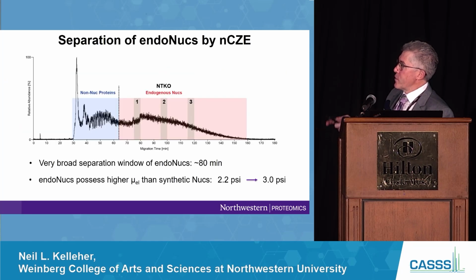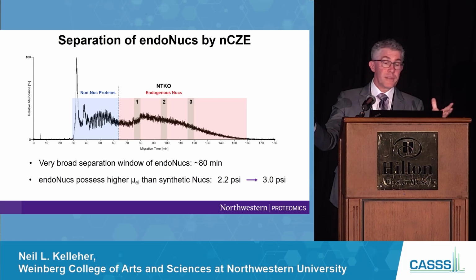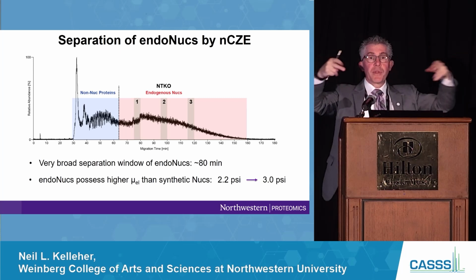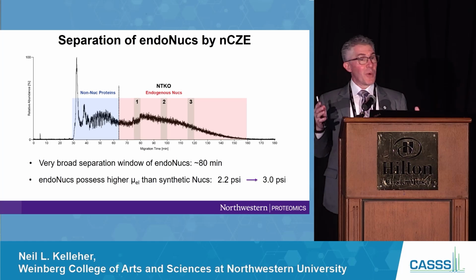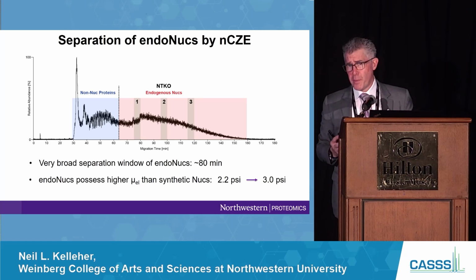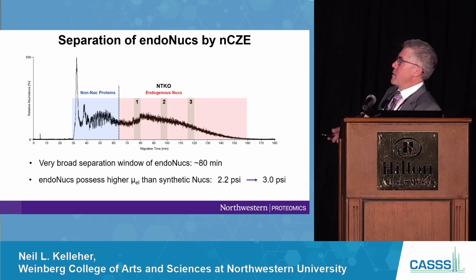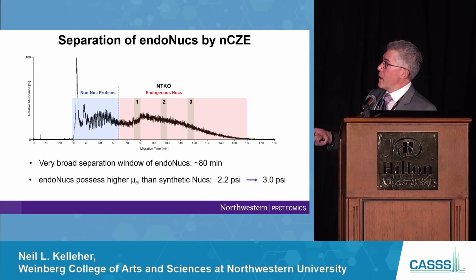So now we're going to do the full experiment, and now we're taking a whole cell line. We're taking 10 to the 8 cells. We're isolating the nuclei. We're isolating the nucleosomes, mononucleosomes, because we're treating with an enzyme called MNase, and that's clipping all of the nucleosomes, which are strung together normally. We're clipping the DNA, and we're creating mononucleosomes from cells. We don't even know how many proteoforms of histones there are, much less how many nucleoforms there are. I just used a new word on you, nucleoforms. It's got to be over 10,000 different forms. Each cell has about 100 million copies of a nucleosome in it, and so there's plenty to go around.